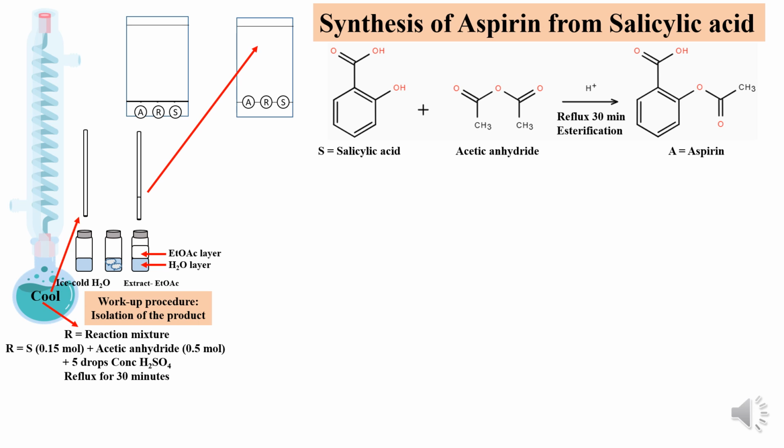Now take the ethyl acetate layer using the capillary and touch the tip of the capillary containing the ethyl acetate layer for a very brief period and withdraw the capillary immediately. Similarly, you apply the salicylic acid at the desired spot marked as S.